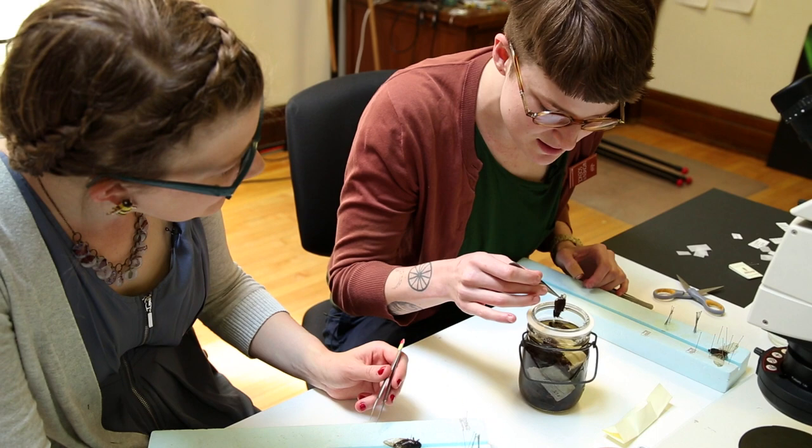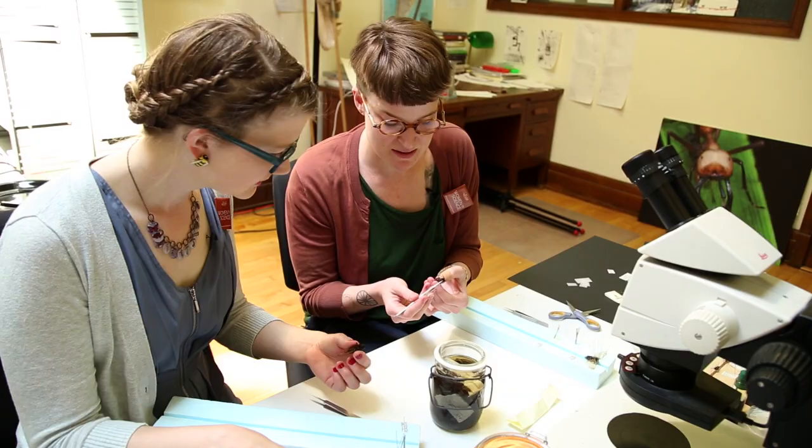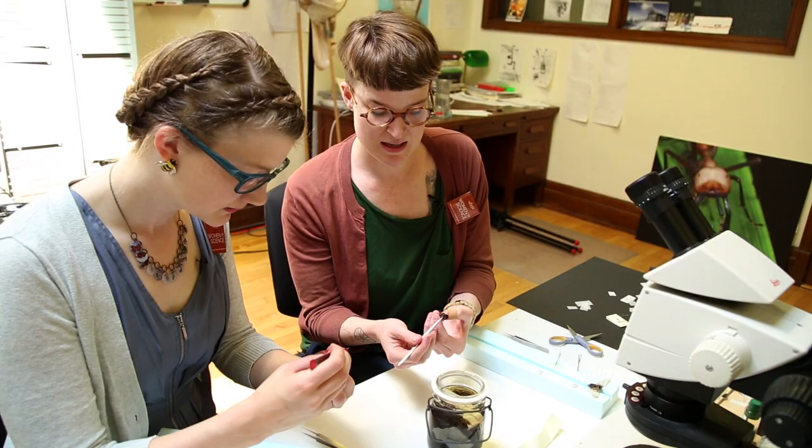The first thing I do is use a pair of forceps to straighten out the legs. With most types of insects — not all — the front set of legs goes forward, like bench pressing, and then the second and third sets aim a little bit behind.